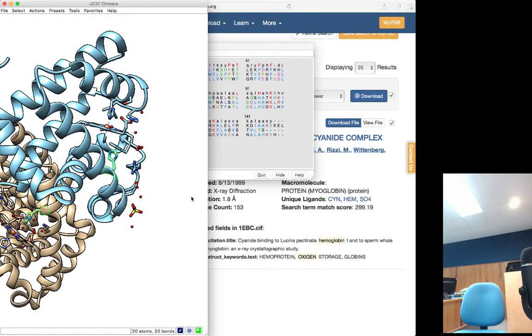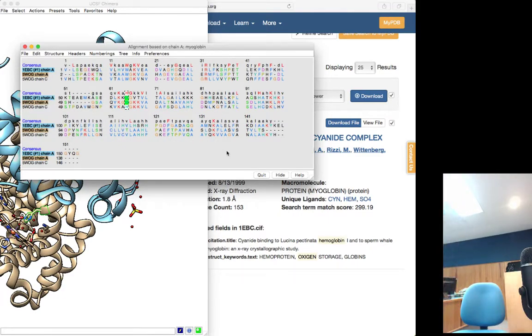Can you put up the sequence alignment? There you go. They should be visible already. What I'm doing is that by selecting, I highlight them and can find them easily, or fairly easily.